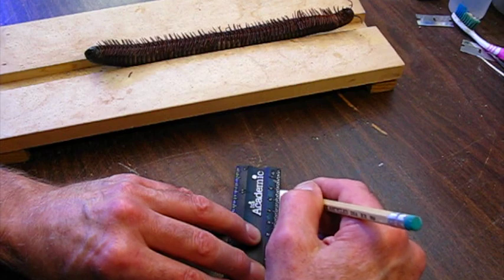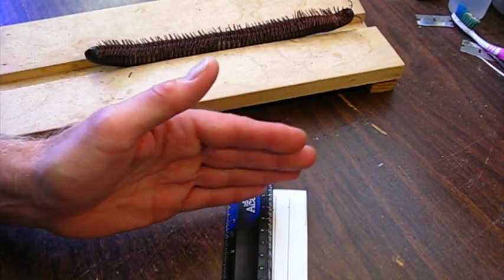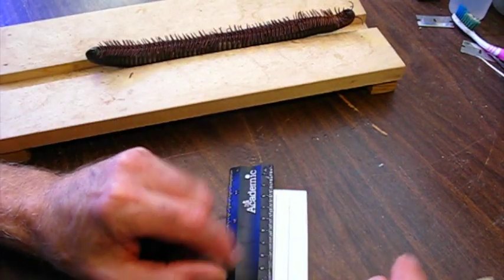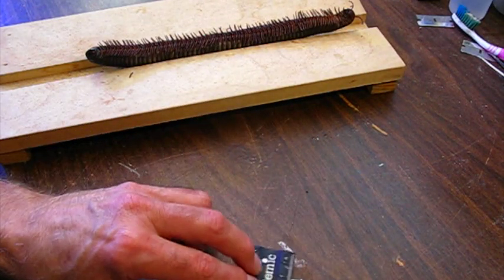I do have a giant millipede pinned in my teaching collection - it's just pinned with pins to support it, resting on the legs, and the legs are just breaking off because they're too fragile to come in contact with the substrate. Now I need my T-support cross members.